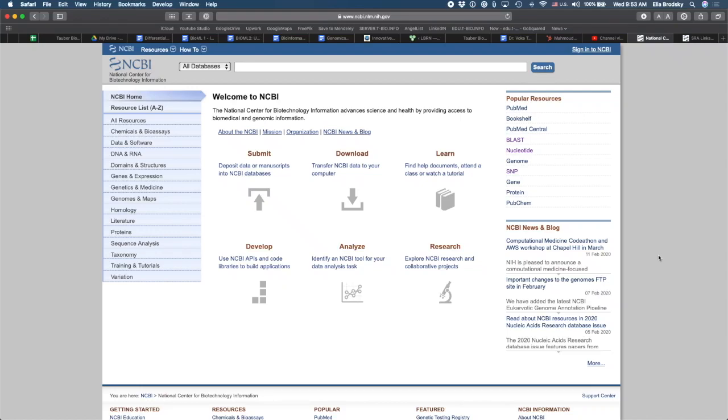This video is going to show how to find data on NCBI, specifically on the Sequence Read Archive, on SRA, and to use that data on the tBio.info platform where you can analyze data without having to download it to your computer, without having to upload it back to the platform.